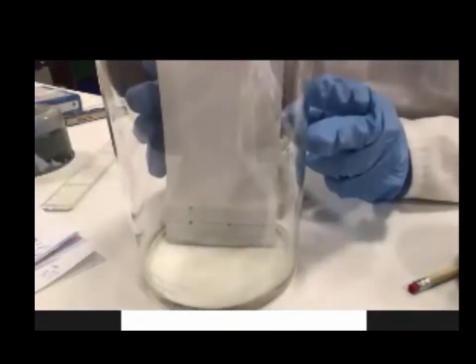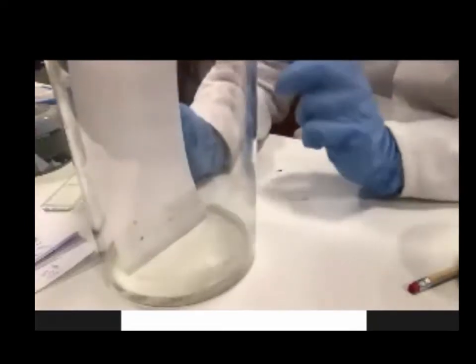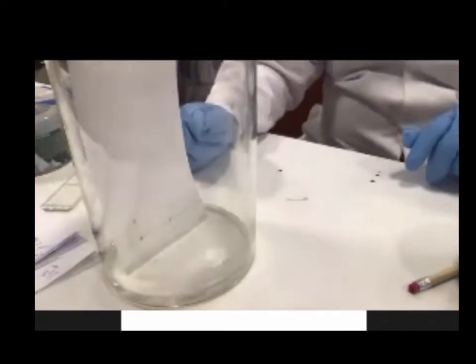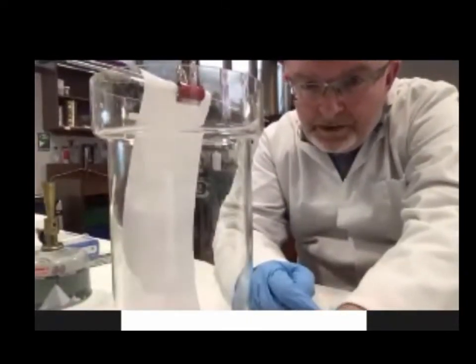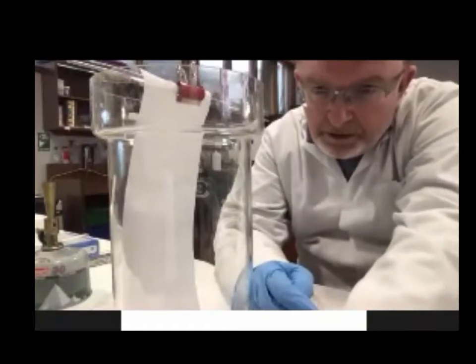I would have to make a whole load of droppers. Yeah, but I want to turn it sideways with another. So we'll let that run for a while. It's rocketing off there anyway. Okay, so hopefully you can see that there's a very fast kind of result. The other thing is the reason I choose the geranium slash pelargonium is that it usually has a good mix of pigments, so you tend to get a good result.